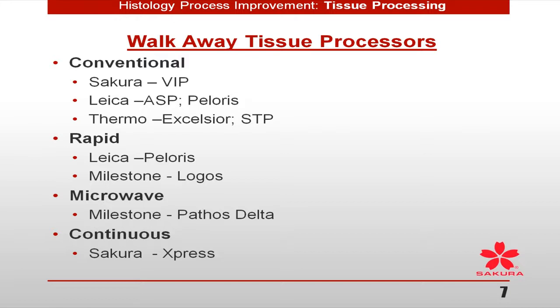In the simplest form, very similar to some of our first tissue processors that we had. Not everybody's as old as some of us, including me. But the reason I mention that is that the technology, the logic, the theory behind the continuous load processor is absolutely updated with the Express instruments, but it is a proven process that we had before we came to the one receptacle and moving everything in and out.